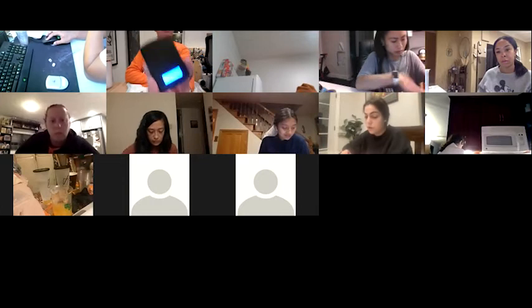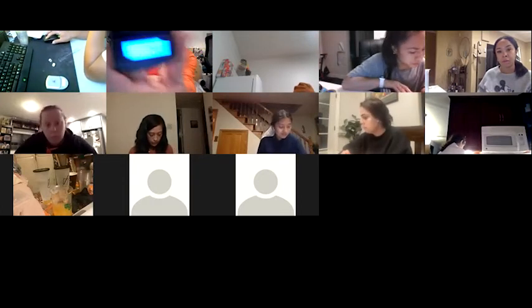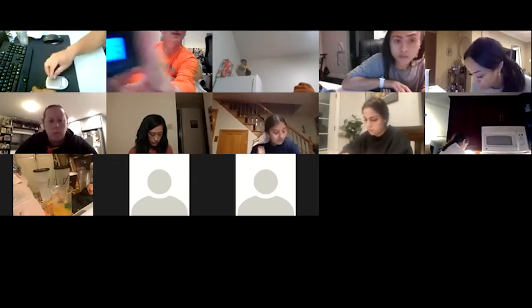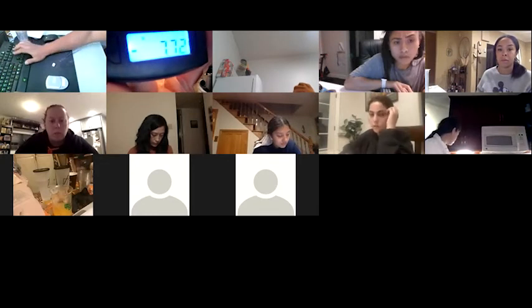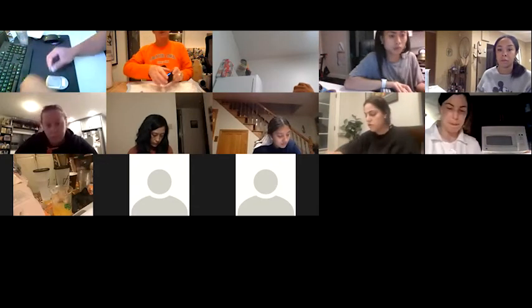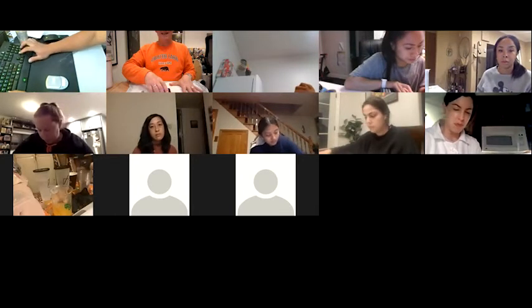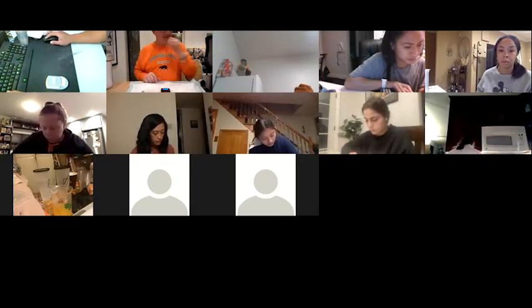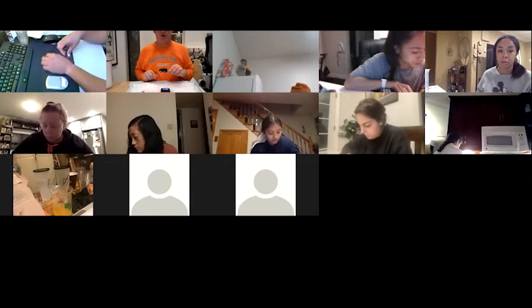So make sure that there's a little G. I don't know if you can see that. There should be a G there. Sometimes you will see a GR, that means grains, or CT, that stands for carats. So just keep hitting the left button until you get the right units. You want G for grams, okay?